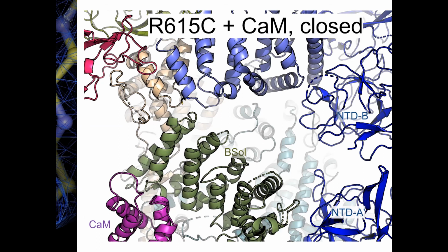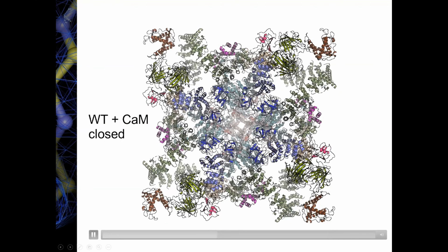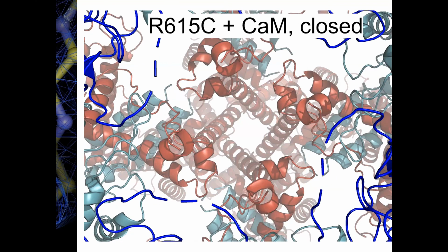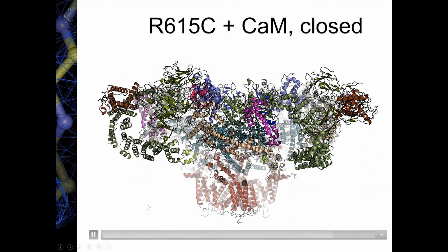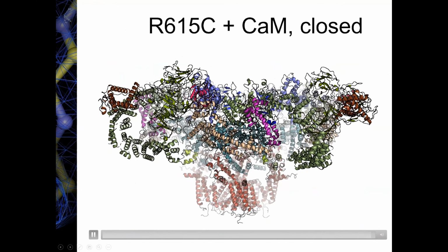motion visible. Also, when you look at the overall structure, you get overall motions here that are very similar to the motions I showed you before, but they're a little bit dampened. And most important here, there are very few changes in the transmembrane region. You might argue that the pore gets slightly wider, but it's still not wide enough to actually permeate calcium ions. And also here on the side of the cytosolic cap, you see some motions that we typically see before.